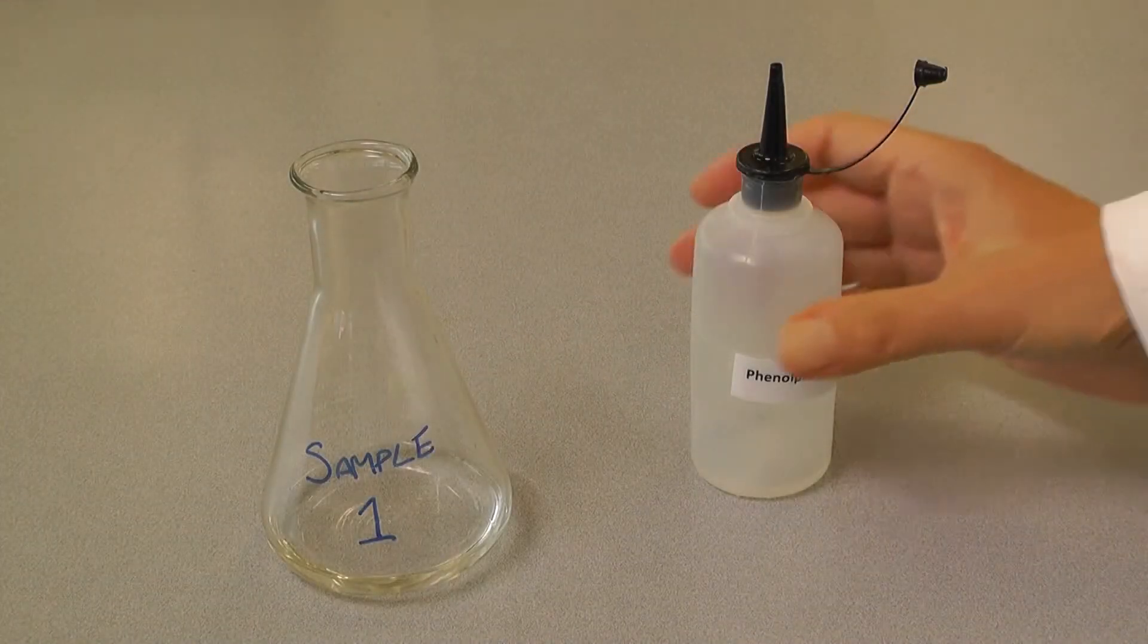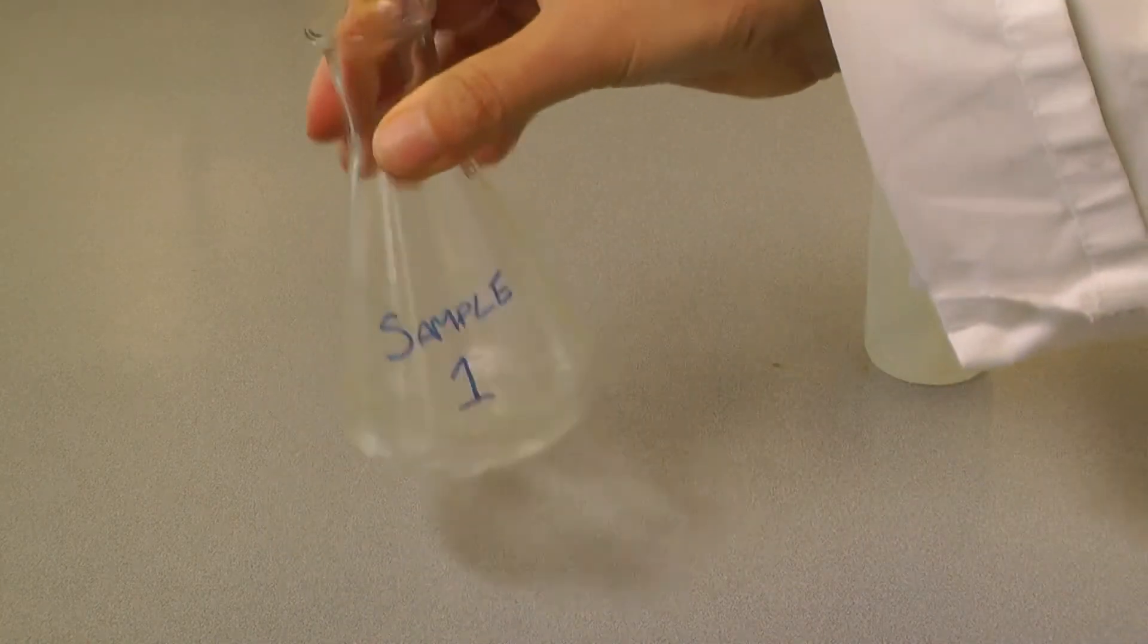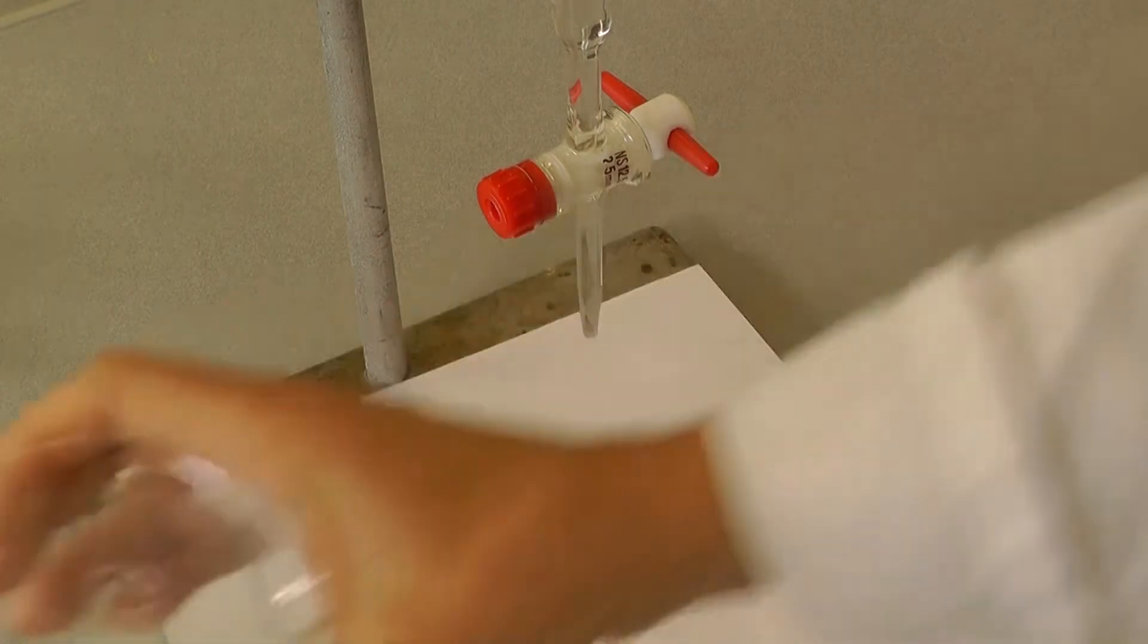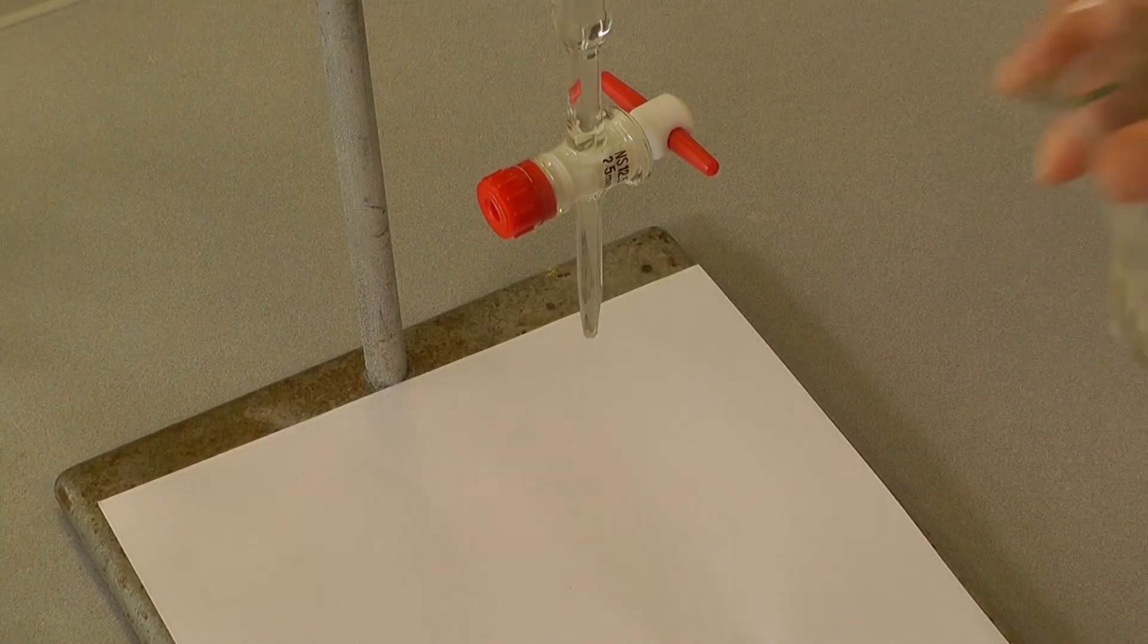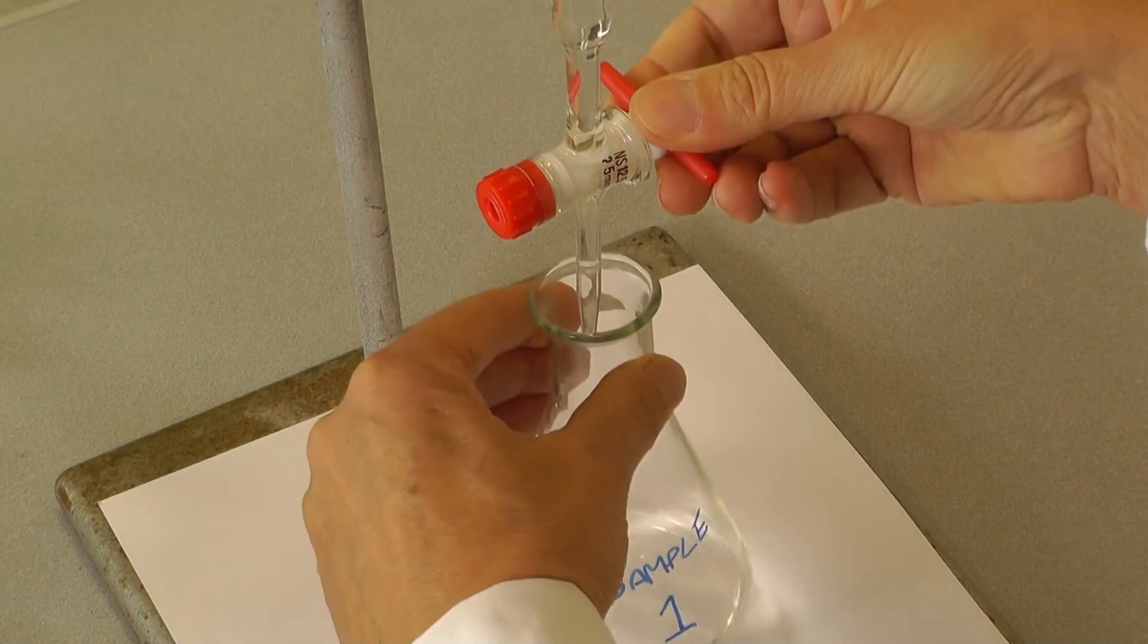Begin by adding a few drops of an appropriate indicator to your reaction flask and swirl gently to mix. Remove the waste beaker and place your flask underneath the burette. It is also a good idea to place a piece of white paper underneath the flask as it will make it easier to see the colour change.